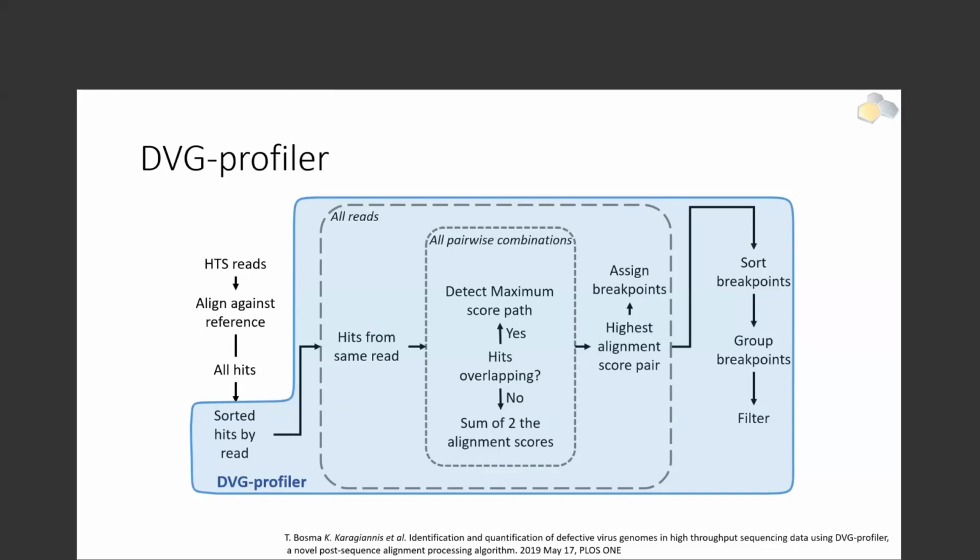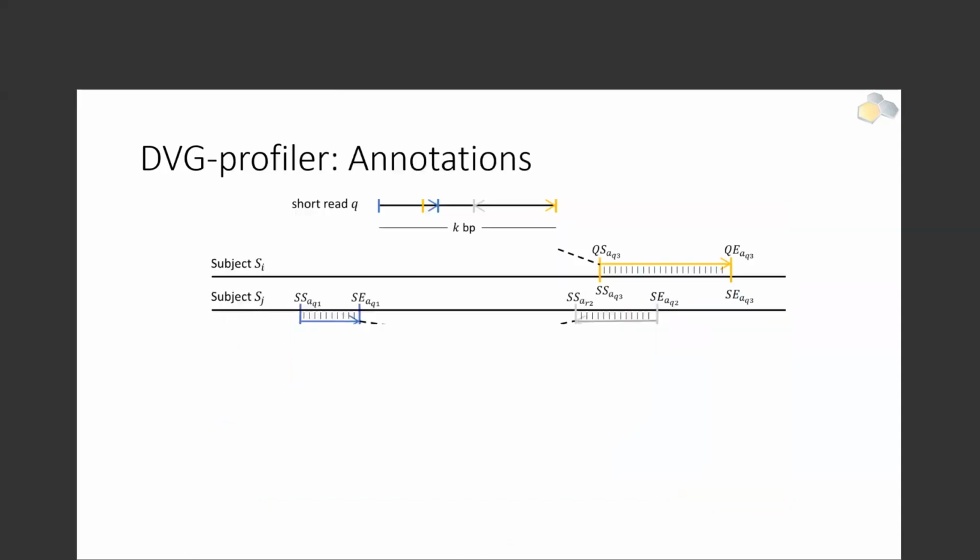Once we do that, we try to find all the places where we report those hits, see how they pile up, and report those locations. So this is practically the overview of the pipeline. Conceptually, I think it's an intuitive approach, and you will see later on that it pays off. There were some similar applications as well.